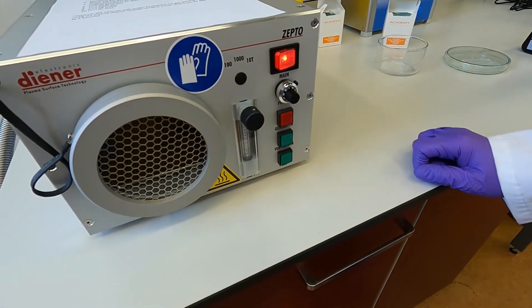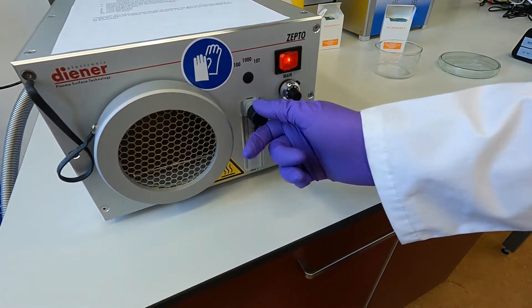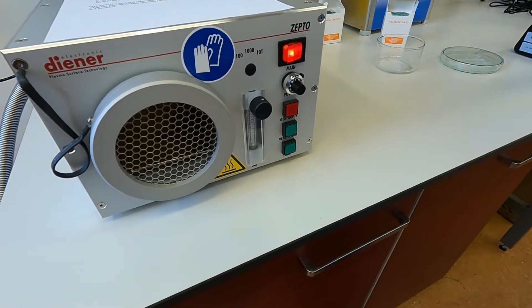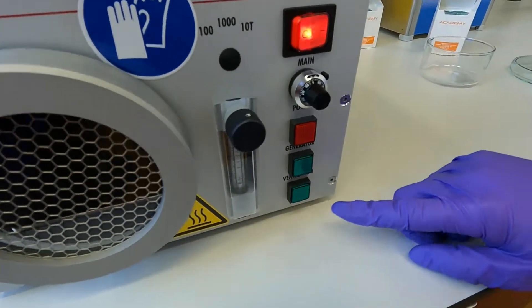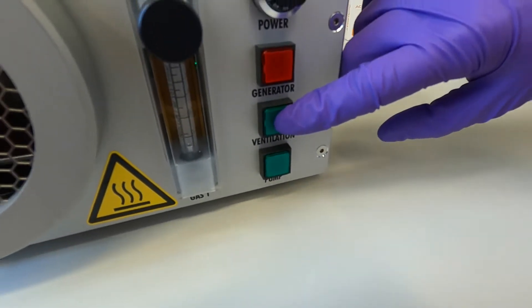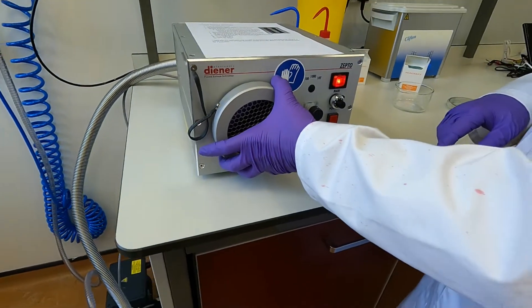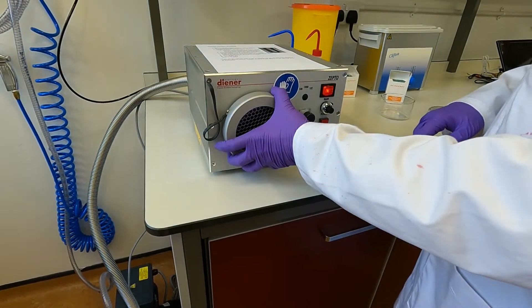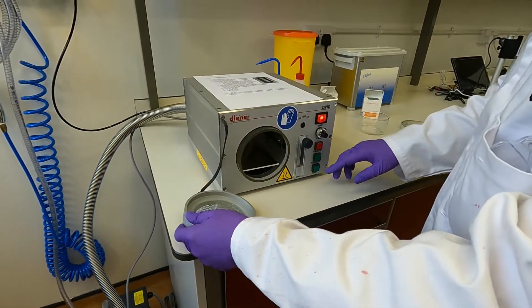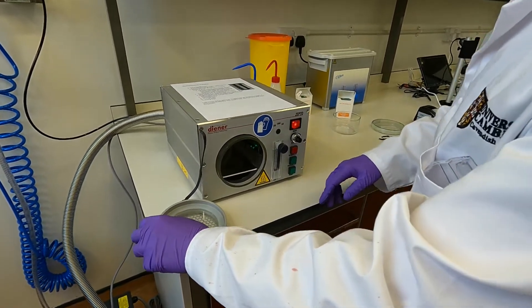We turn on the main power, we make sure that the gas valve is closed and that the power is at 100%. The first step is to turn on the ventilation, which is this green button here, and this is to release the vacuum so we can remove the lid.